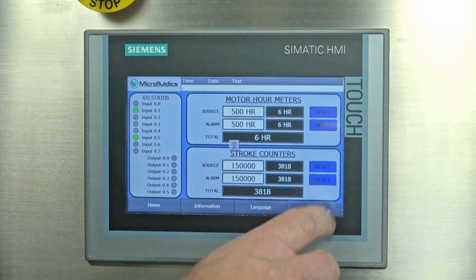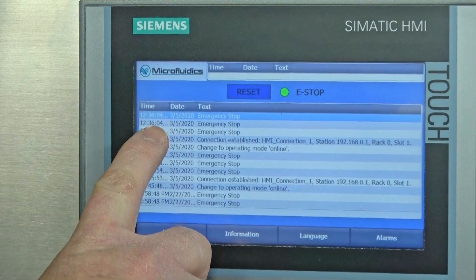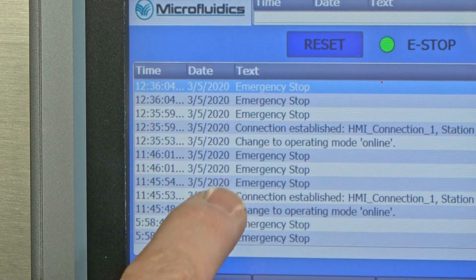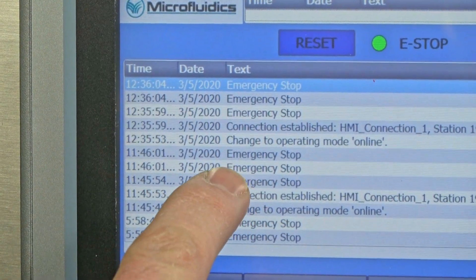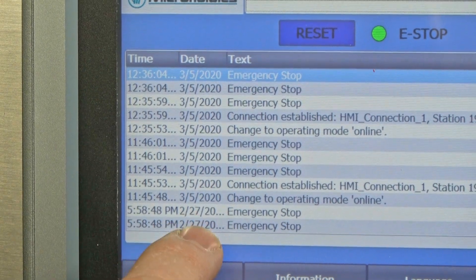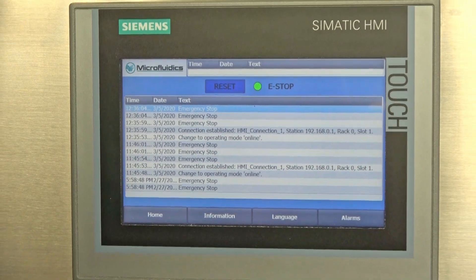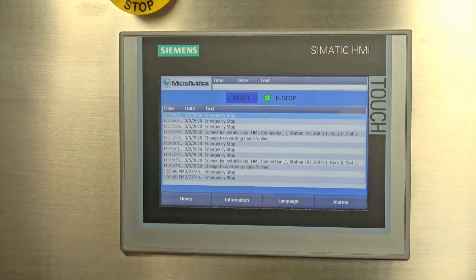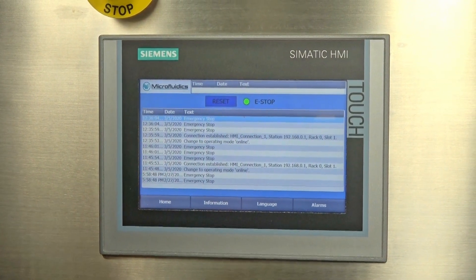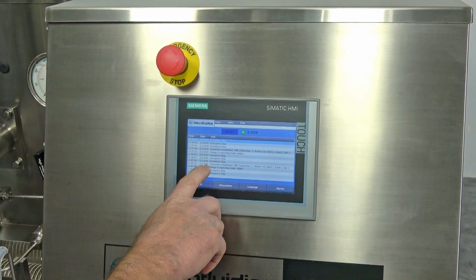Service on this is not even close to being due — that's at 150,000 strokes or 500 hours. I also want to go over to the alarms page. It looks like March 5th of 2020 is where everything was recorded, and there were a lot of emergency stops. One thing about this machine is that it's only 110V, which is really nice, but if you plug it into an outlet that isn't a fully designated 20-amp breaker specifically for this machine, you'll kick the breaker and get an emergency stop error.